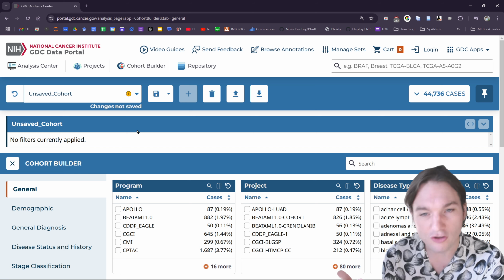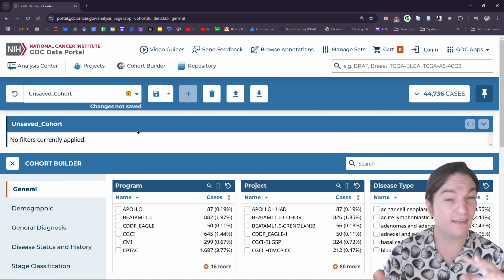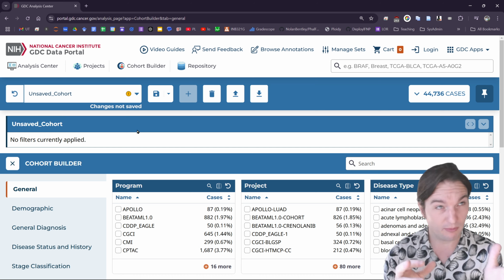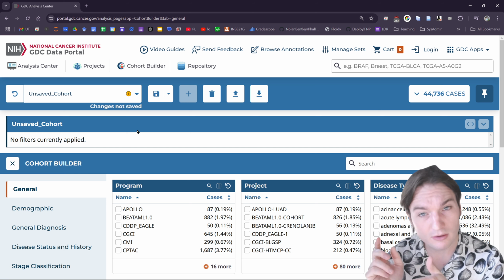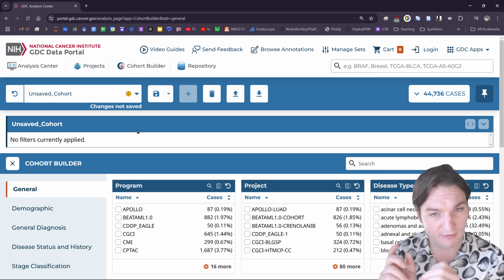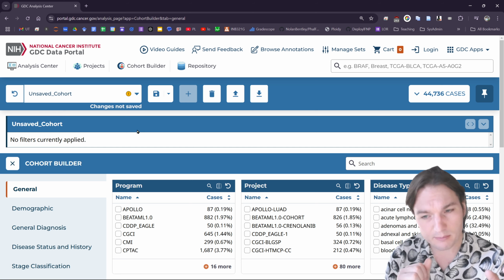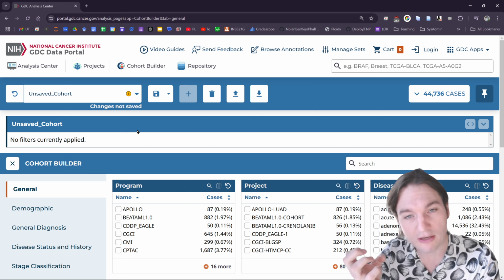And so for my experiment, I'm wanting to look at the presence of this mutation versus, well, the best comparison is no mutation in that gene. Please note, I didn't say not that mutation. There is a difference. We're going to actually have to do a lot of work to make that happen. So: has the mutation, has no mutation.